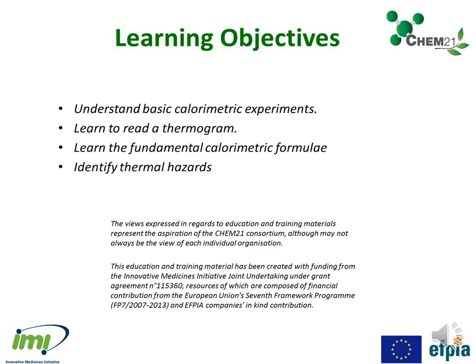This last module on process safety will help you to understand basic calorimetric experiments, read a thermogram, learn the fundamental calorimetric formulae, and identify thermal hazards.